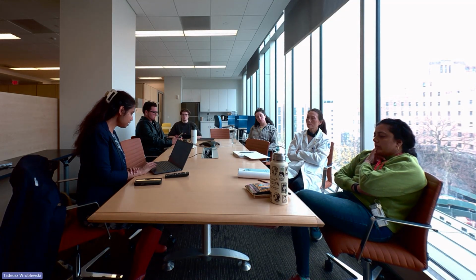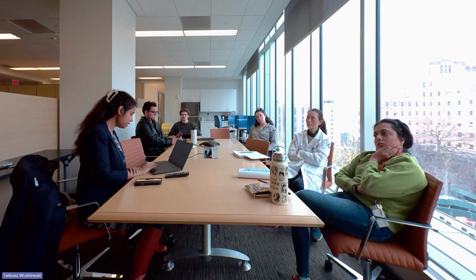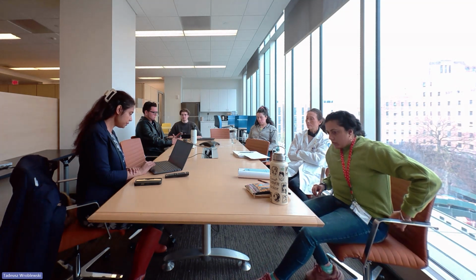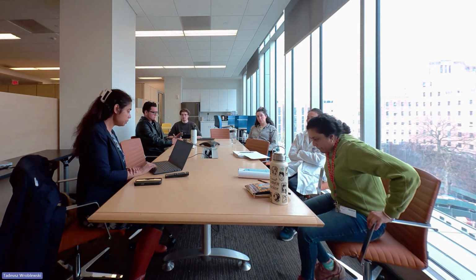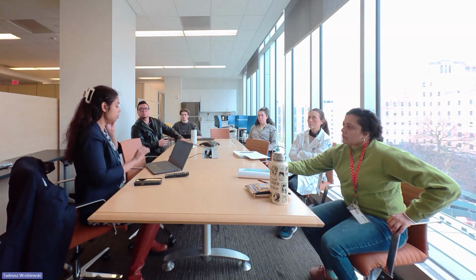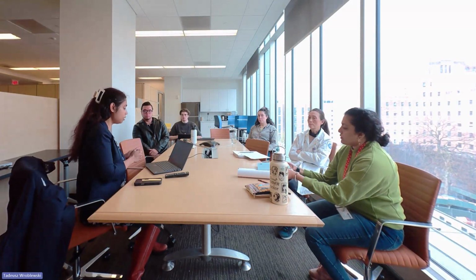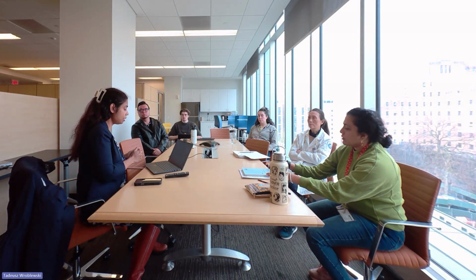So yesterday I think I shared the protocol, right? Which is the cfDNA specific protocol. This one. So we'll do that. I think the first thing we should do is take out all the reagents and let them thaw, because it takes time.